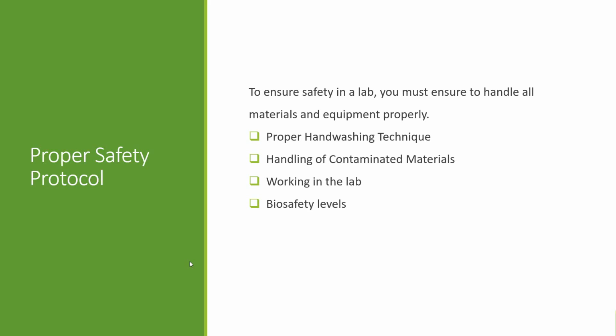So when we talk about lab safety, safety is going to start with proper handling of materials and equipment. That means proper hand washing techniques, safe handling of contaminated materials, general lab conduct, and even understanding those biosafety levels. And these are all things that are going to also be covered in your Connect lab.